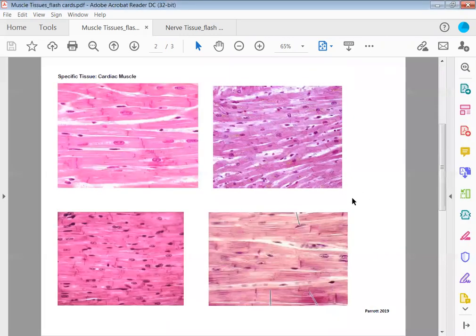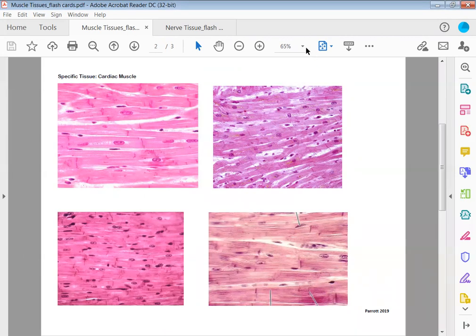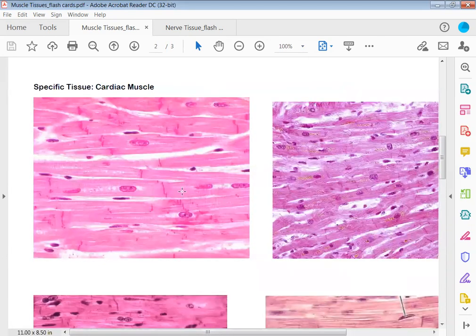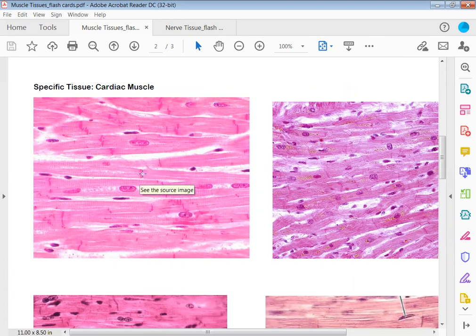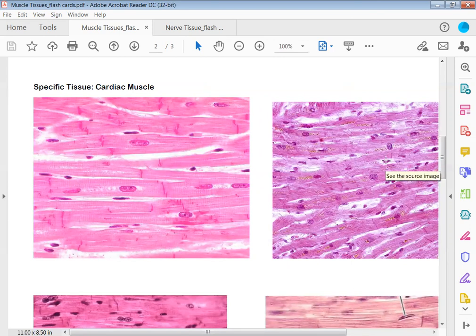The next one is cardiac muscle tissue. Cardiac muscle tissue has smaller, thinner fibers that are branched — you can see this fiber branches up here and down here. You'll also see tiger striping: dark band, light band, dark band, light band. That tiger striping is called striations. You also have these super dark lines called intercalated discs. An intercalated disc is a joining point, similar to a zipper, that joins two cardiac muscle cells together. The dark round structures are the nuclei.